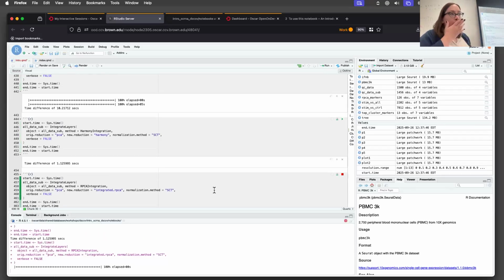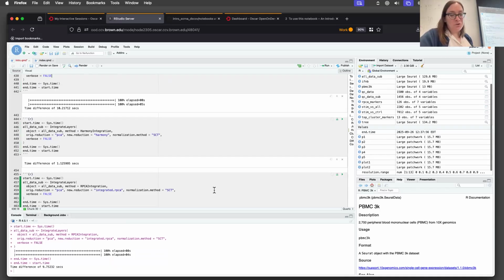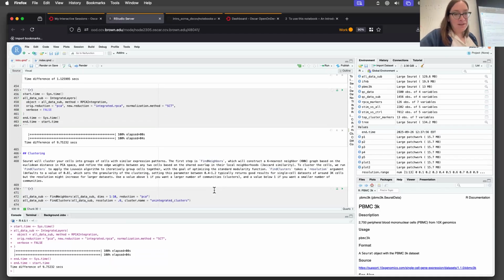Jocelyn, yes. Is there a time that you think of where you want to use CCA or RPCA over Harmony based on how well Harmony seems to work? Eric asks if there's ever a situation where you'd want to use CCA or RPCA over Harmony.